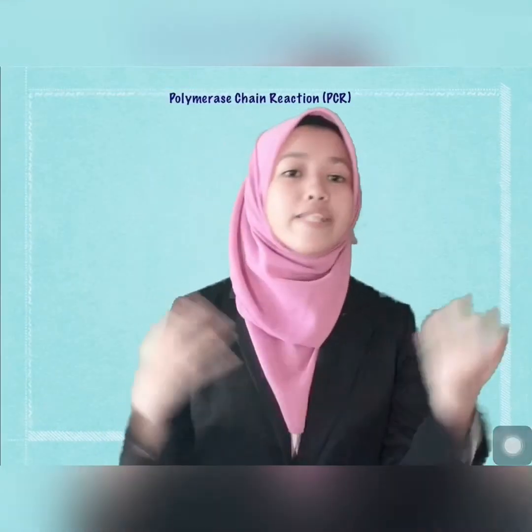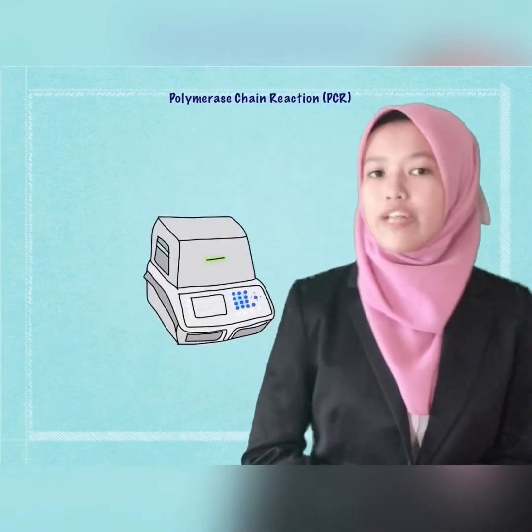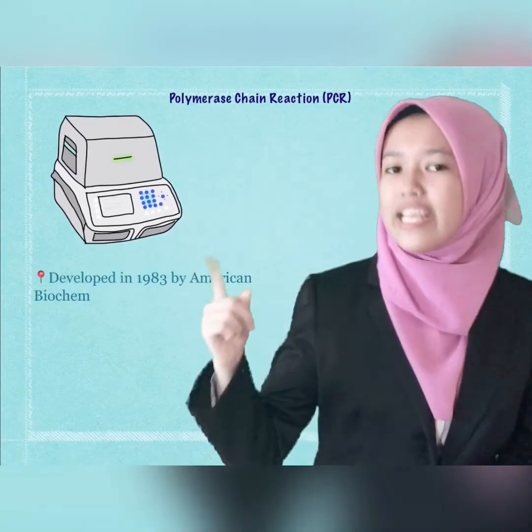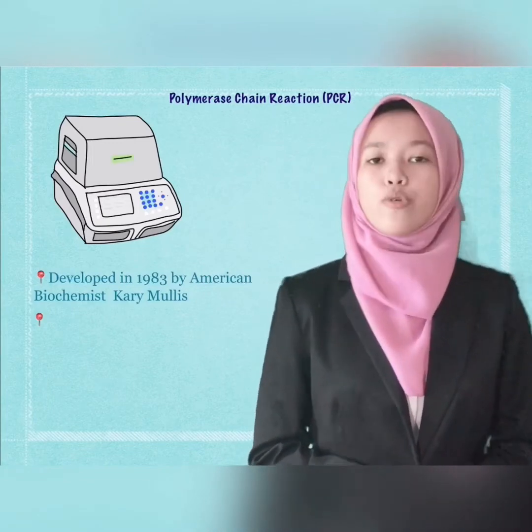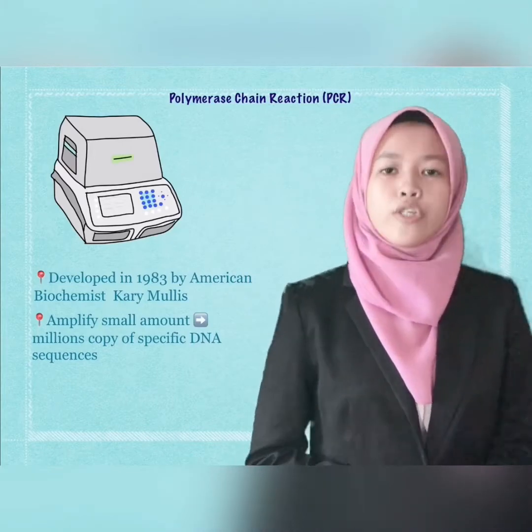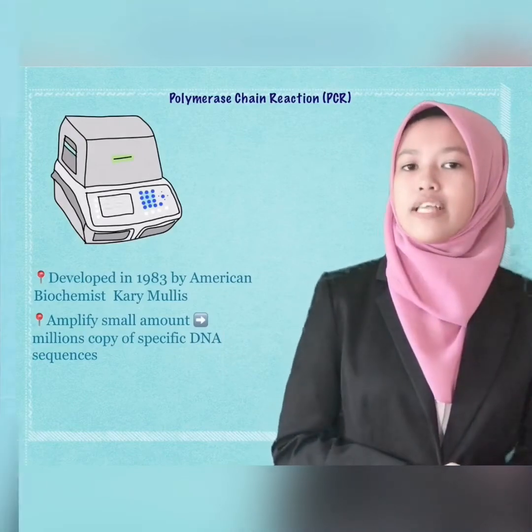So what is PCR? PCR stands for polymerase chain reaction. It was originally developed in 1983 by the American biochemist Kary Mullis. It is used to amplify a small amount of DNA to a millionfold copies of specific DNA sequences.